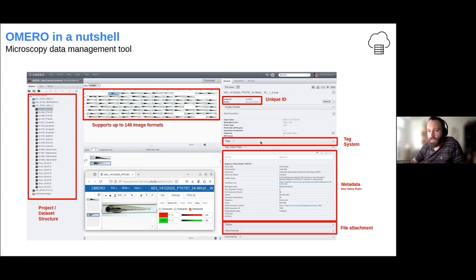You have a tag system that allows you to create a hierarchical structure of your data and have different tags for different images and search them in a nice way. You can also attach metadata that works with key-value pairs that are also searchable. So you can search, for example, associated values like experimenter, instrument, biological entity, and so on. This is completely flexible and depends on your experimental setup.